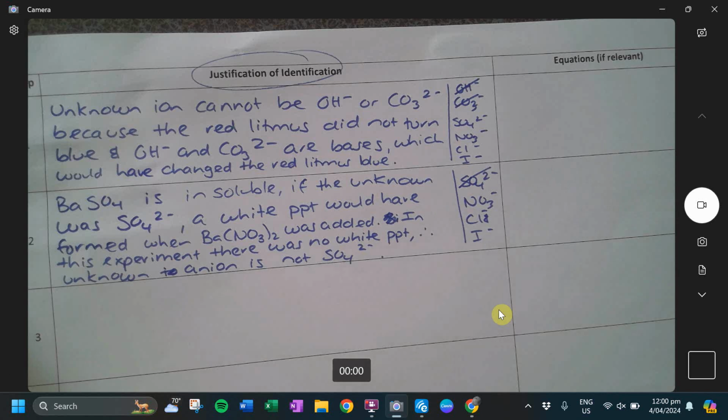And I'll get some more of my unknown. If you need more unknown, go up and grab some. I just crossed it out. I was going to write ion on it, now I should write anion. All right, keep going.